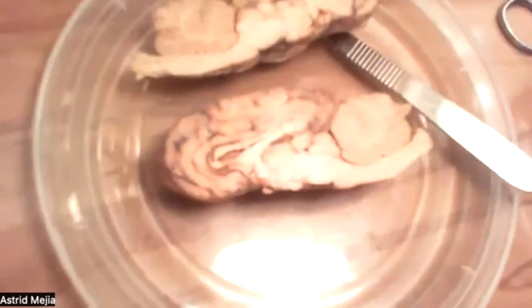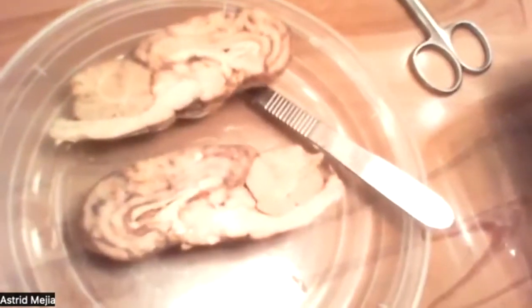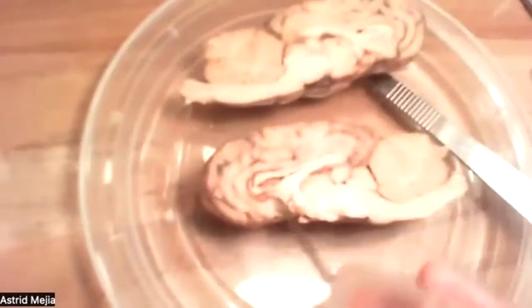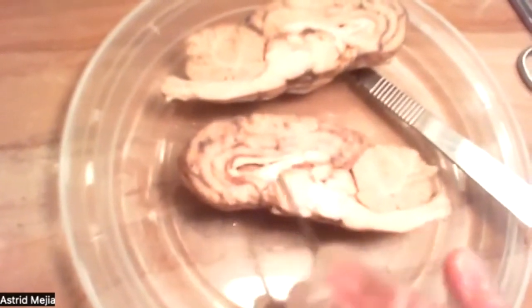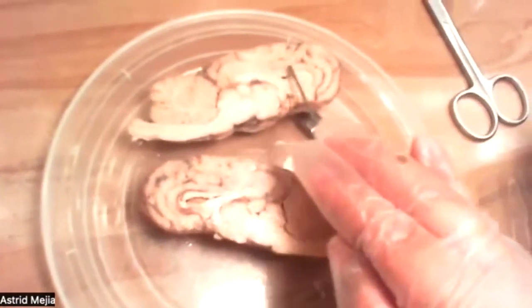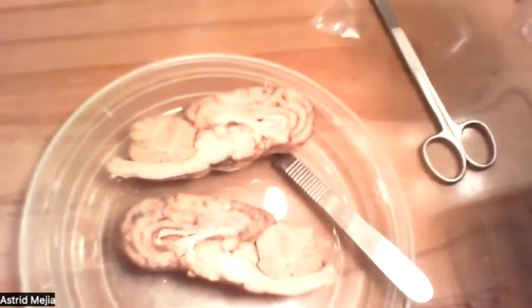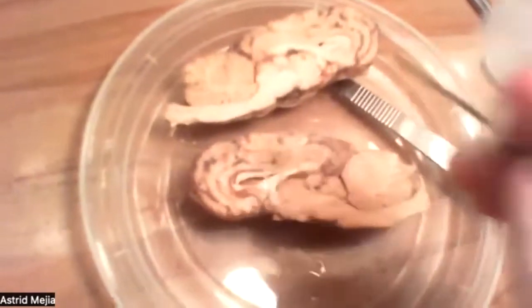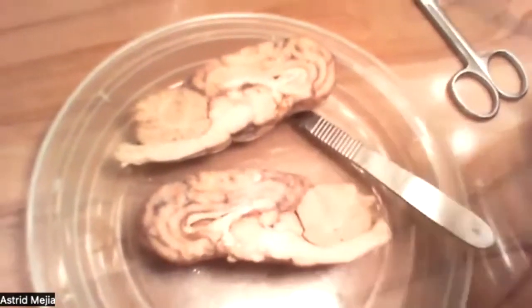Okay, and then from here you can also see the corpus callosum, which is basically this area right here, this white part of the brain. And the corpus callosum ensures both sides of the brain can communicate and send signals to each other. And then you can still see the cerebellum. It would be this little cloud right there.